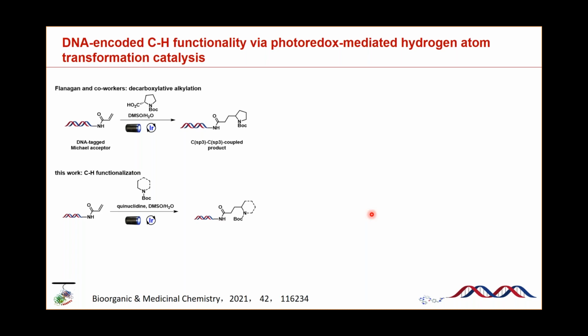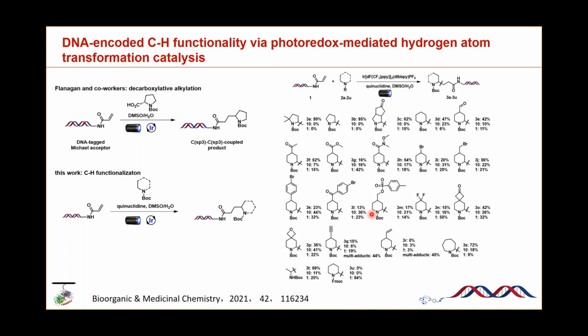We can add it both ways, because we also find that the side product can itself have this type of addition product. But fortunately, we can have this Boc-protected amine as the major product, and this can be used as a functional group.